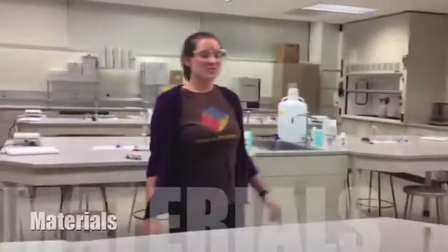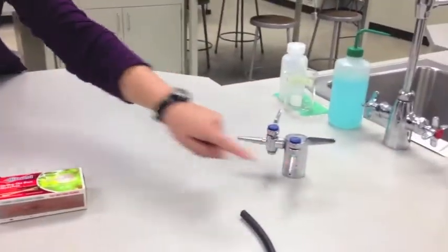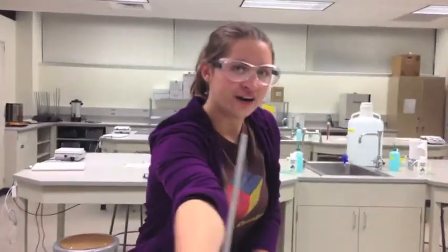Welcome. We're going to show you how to do the flame test, which is a scientific test where you put metallic salts in flame and observe its color to figure out which unknown cation is within the salt. So these are the materials you're going to need. You're going to need a bunsen burner, a gas source, matches, salts, two beakers, and a wire.